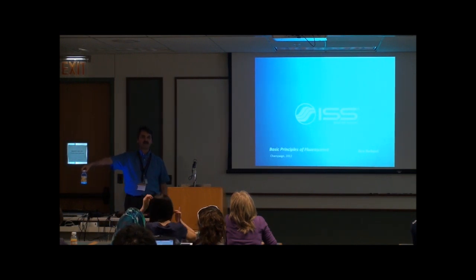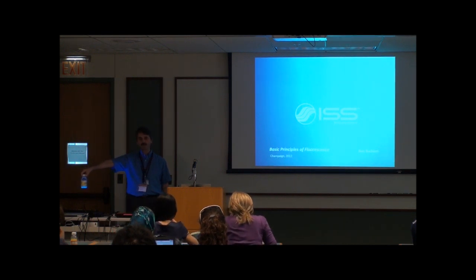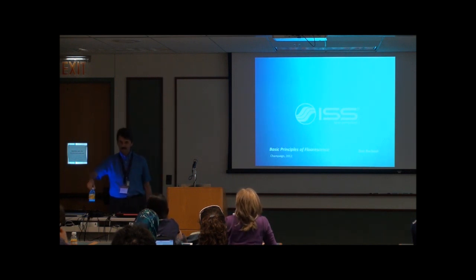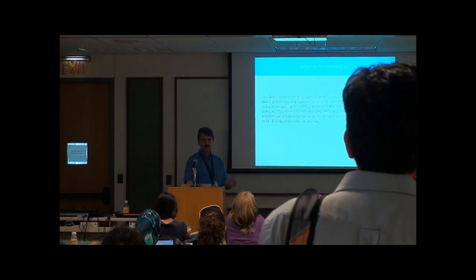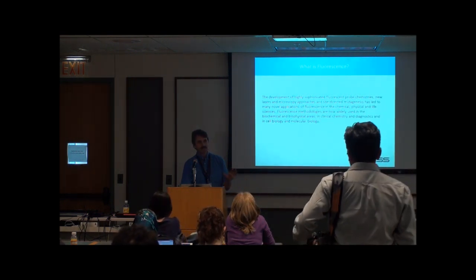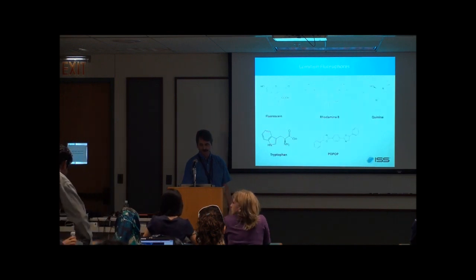If I put the tonic water close to the UV lamp, you see it light up. Why? Inside there is some quinine. The quinine absorbs some radiation emitted by the lamp in the UV. The fluorescence is this bluish light that you see with your eyes. So the question is, what do we do with fluorescence? Why is it important? How does it help us in our research? So we will explore a few opportunities this morning, and we just touched the basics of fluorescence. Next week you will have a chance to look at some instruments.